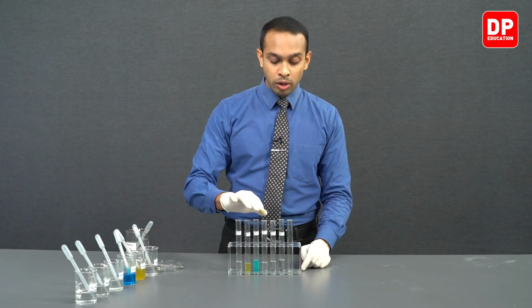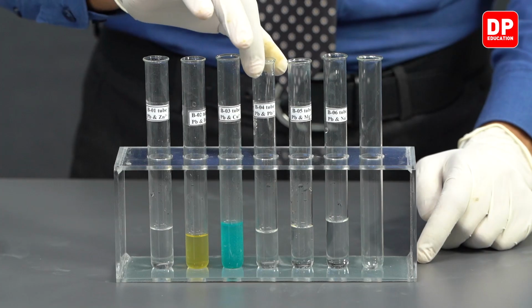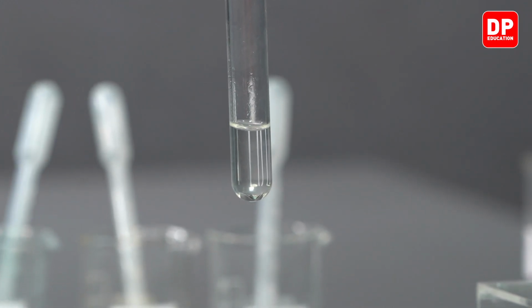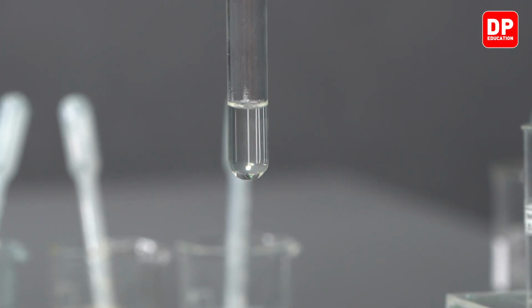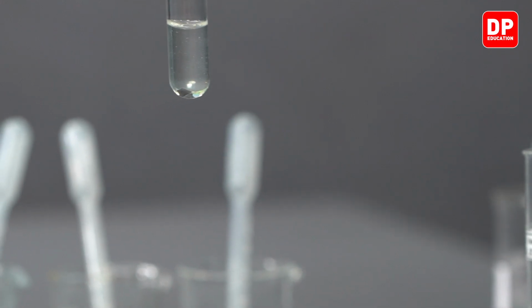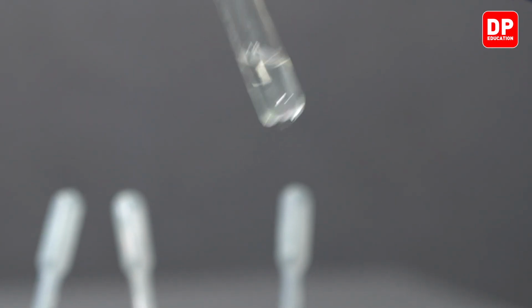Then we will move on. We'll talk about the copper sulfate solution later. Then we'll move on to the other solutions that did not show reaction. If you take a look at lead metal reacting with lead 2 plus ions, since the lead metal is present in its own ions, there is not going to be any reaction here, and you will see there's no color change, as well as the lead metal pieces we added into this solution is still at the bottom unreacted.